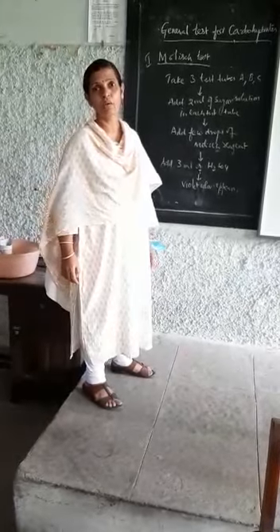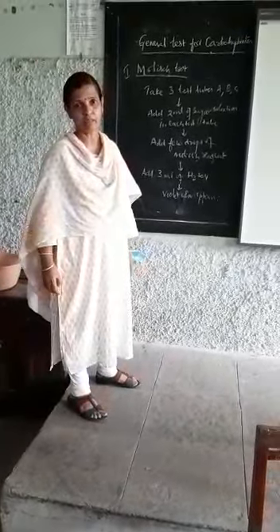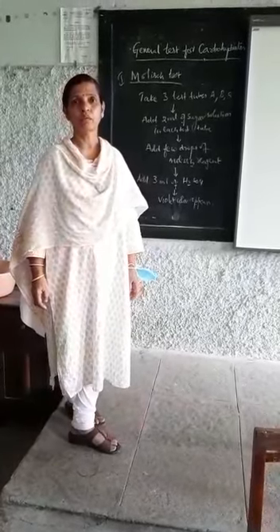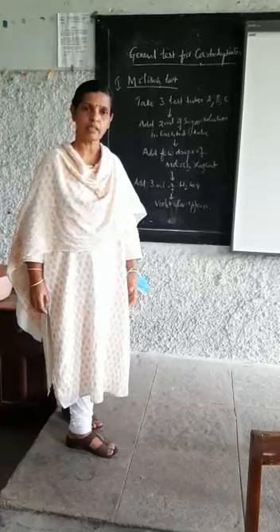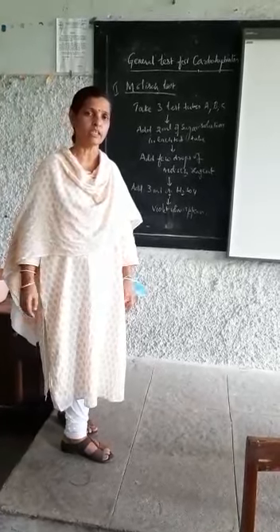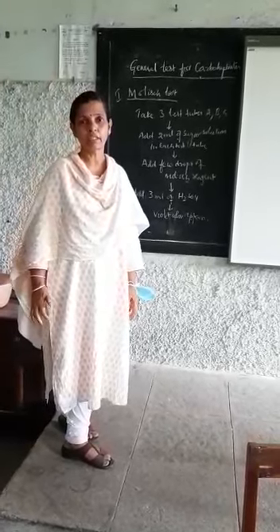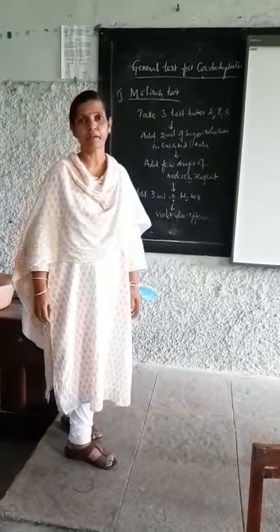Afternoon, students. Now we'll go for the next experiment regarding the carbohydrate analysis. You can do the analysis of carbohydrates qualitatively as well as quantitatively. But as per your syllabus, we are going to do the qualitative analysis of different types of carbohydrates.